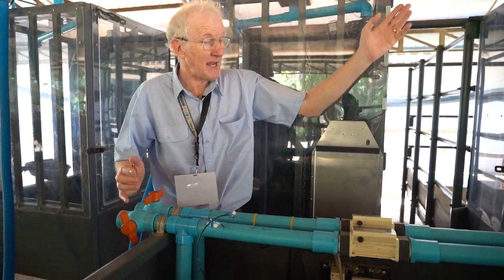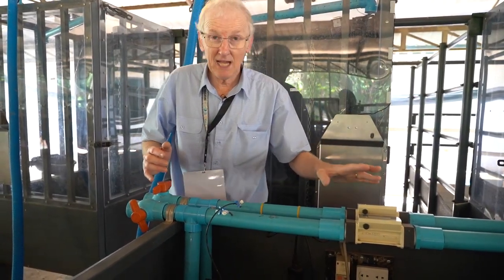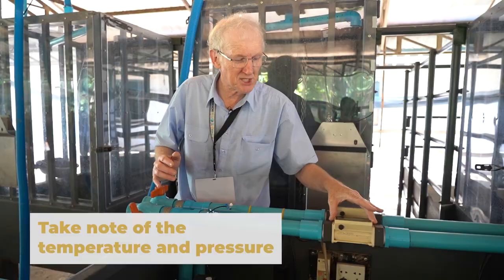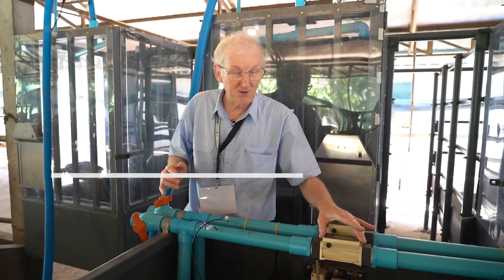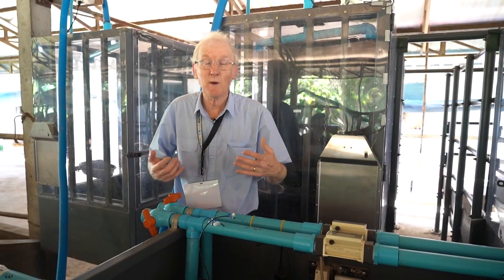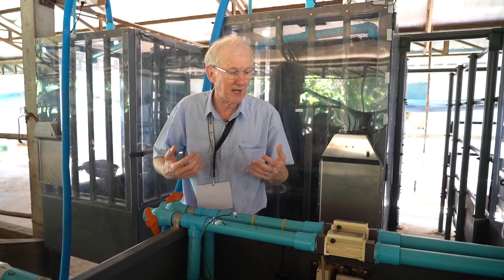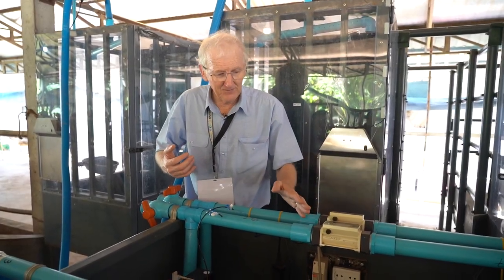So we've got our airflow from the chamber. We've got a flow rate measurement. We need to be careful whether that is temperature and pressure corrected. We must know the temperature and pressure of the air that we are measuring, or we will not be able to convert the methane production into grams per day. Okay, so we have our airflow.